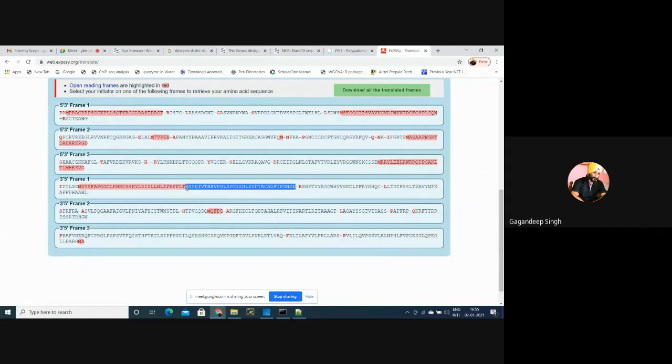Maybe there is no function for this particular translated region. In BLASTX, the nucleotide is translated to protein and then blasted against the protein database. Maybe this is the reason we are not getting any particular function and this comes under hypothetical proteins only. We can select the particular translated region, but this is a very small region, so I don't know what kind of protein this is.